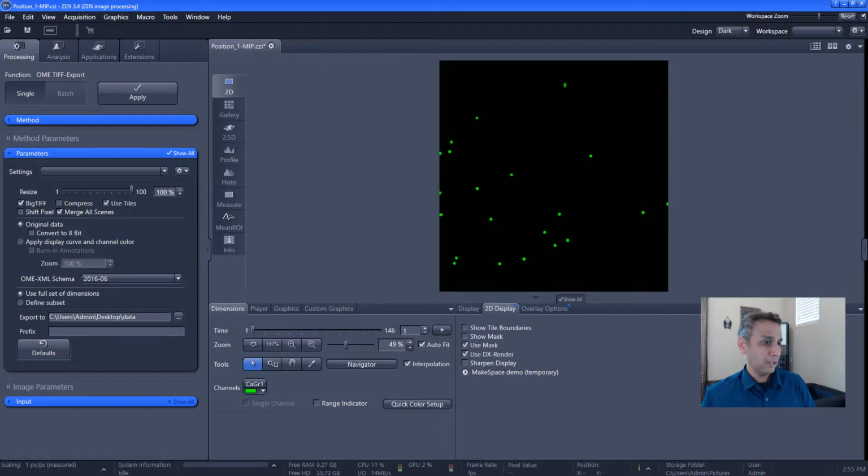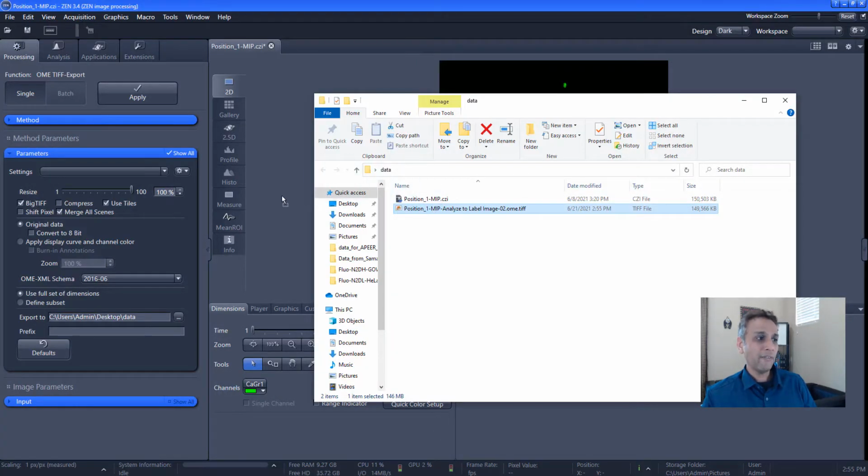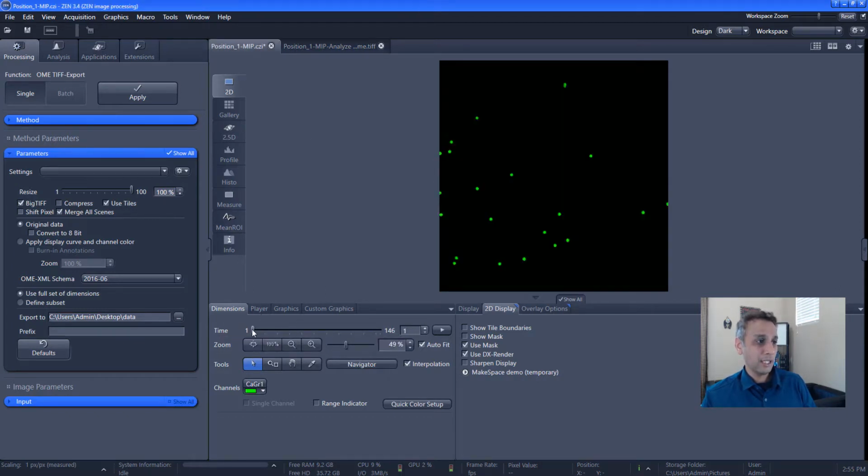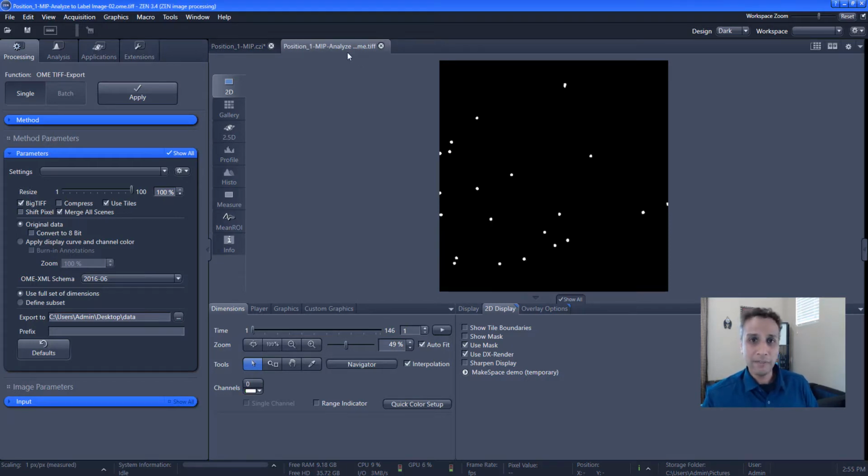We can leave that open. And let's open our OME TIFF file just to make sure that this is still a time series, and everything looks as it's supposed to. Okay, so we have our OME TIFF right here.